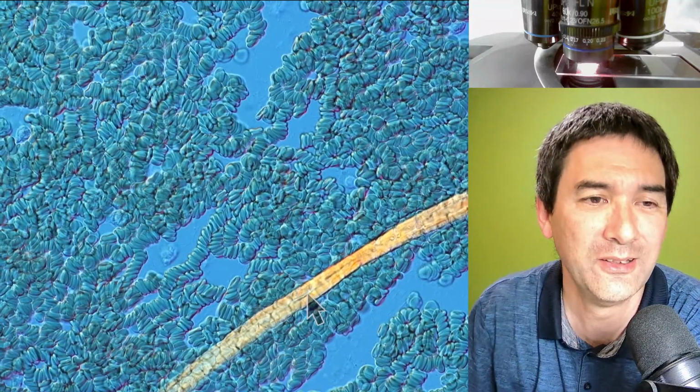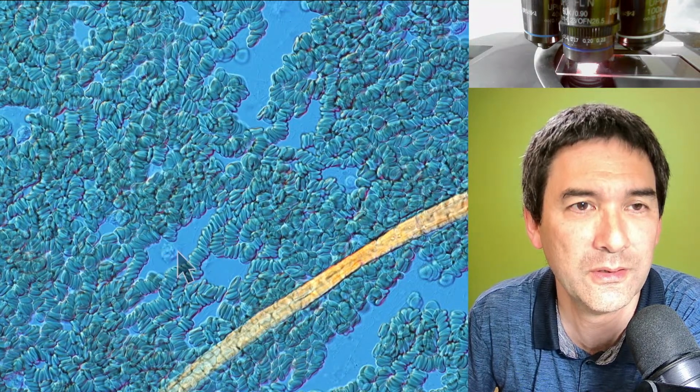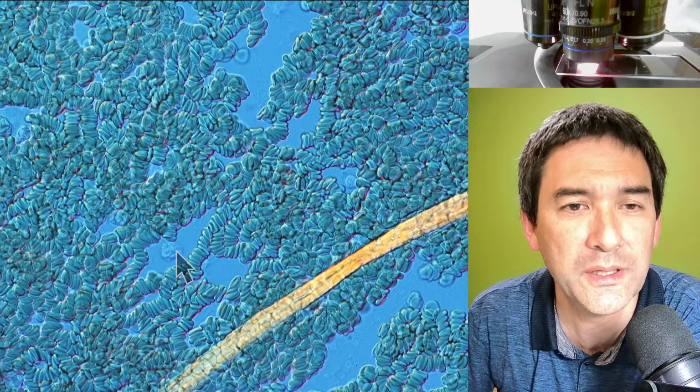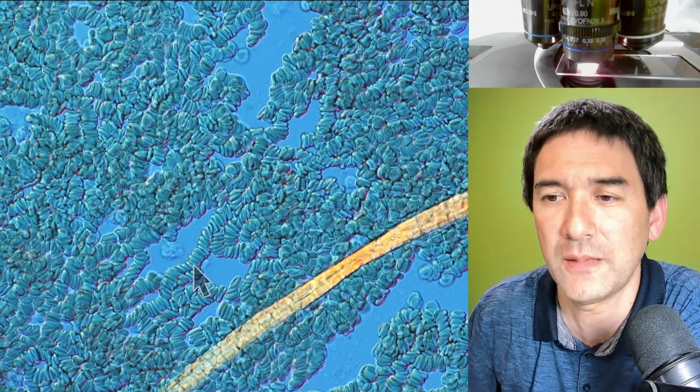Look at this guy here. Maybe you're able to see this one over here. It might also be a white blood cell. Not all white blood cells actually move. Yeah, so there are different types.